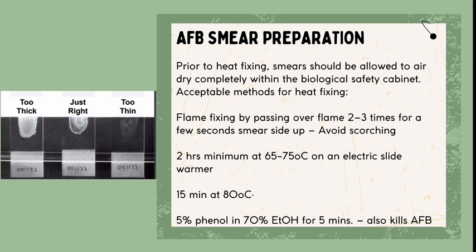So these are the acceptable methods for heat fixing. So the first one is via flame. So you should pass it over the flame 2 to 3 times for a few seconds and then the smear side up. And please take note that you have to avoid the scorching of the sputum that is being smeared.